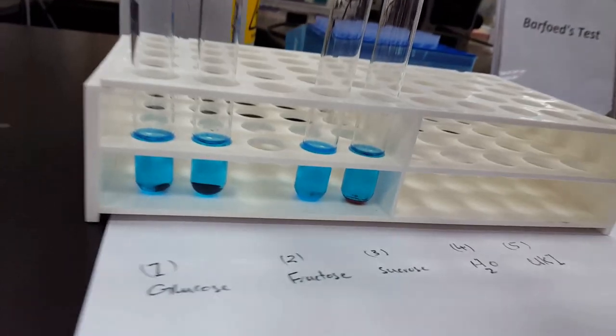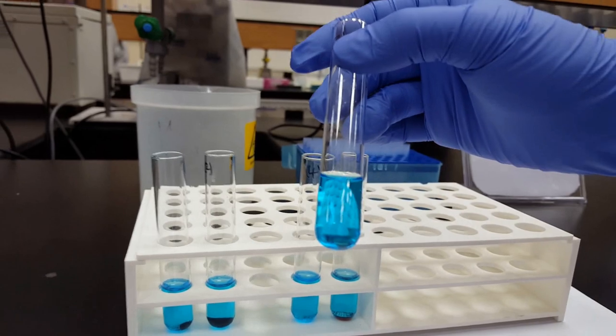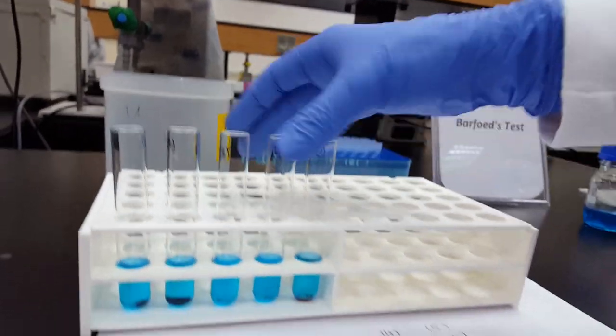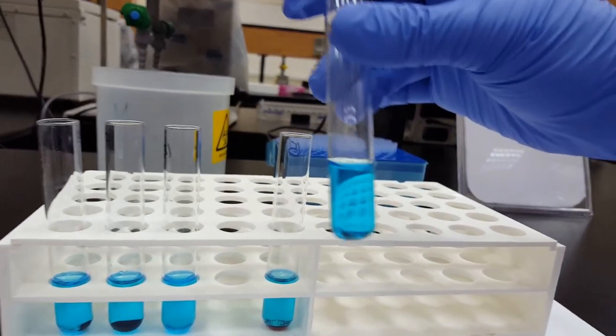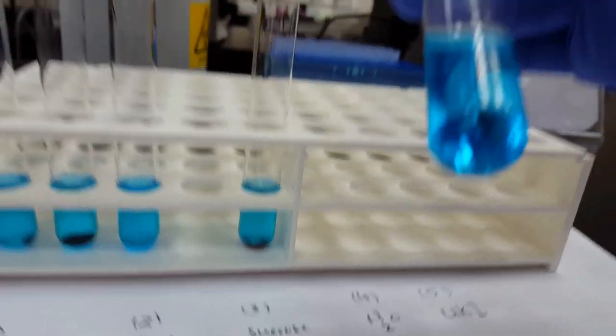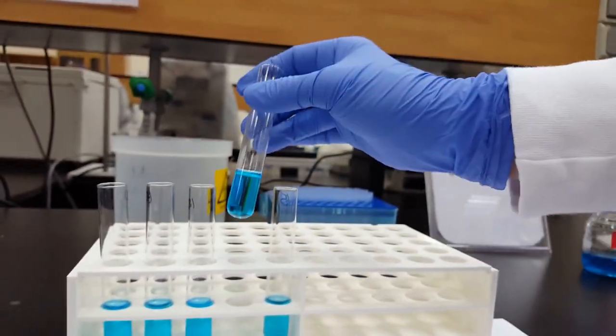The third test tube, what does it have? Sucrose. Sucrose is a disaccharide, and as you can see here, there is no precipitate, so this is the right result. What about our fourth test tube? In the fourth test tube, we just placed water, and this makes sense. There is nothing here. There is no precipitate.